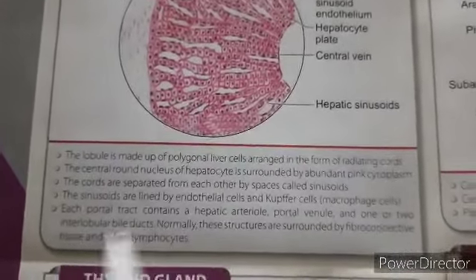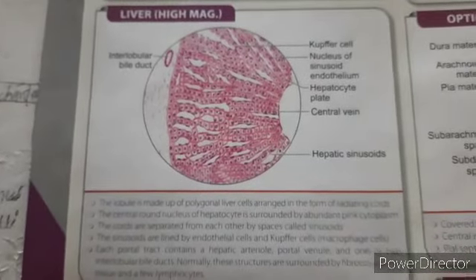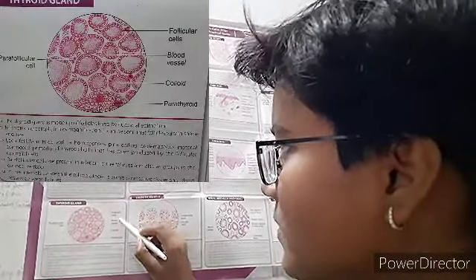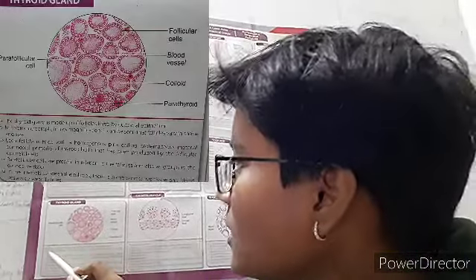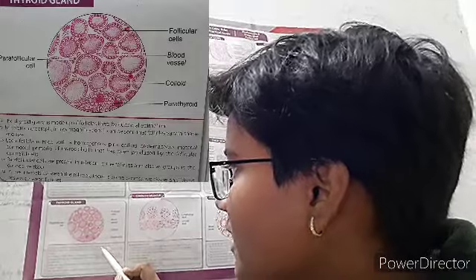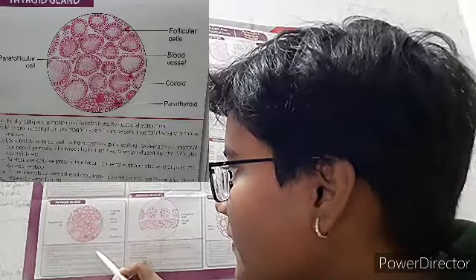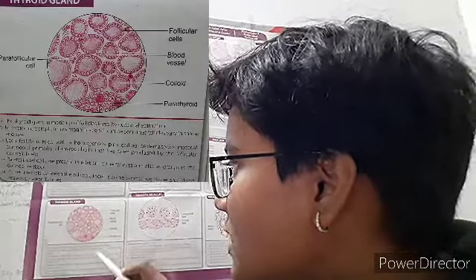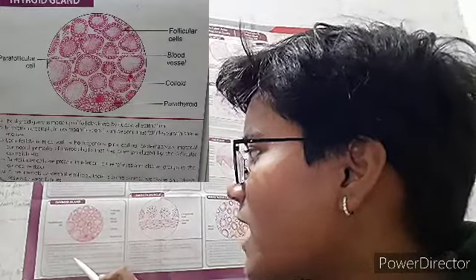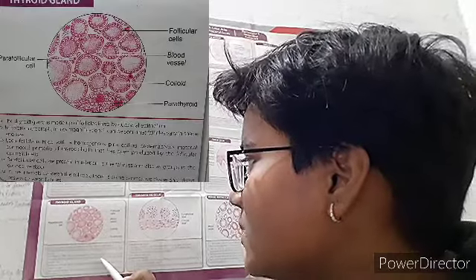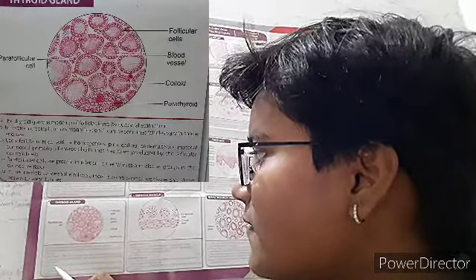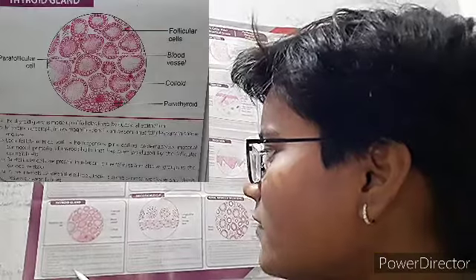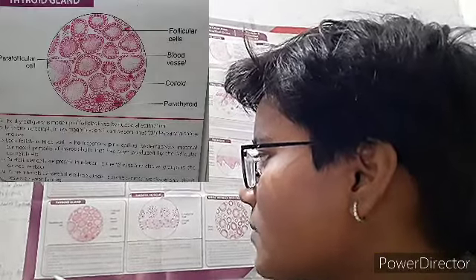Now the thyroid gland. Visible structures include parafollicular cells, follicular cells, blood vessels, colloid, and parathyroid. The thyroid gland is made up of follicles lined by cuboidal epithelium. Follicles vary in shape and size. Each follicle is filled with a homogenous pink colloid — a proteinaceous material composed primarily of thyroglobulin produced by follicular epithelial cells. Parafollicular cells are present in relation to the follicles and are also grouped in connective tissue between the follicles.